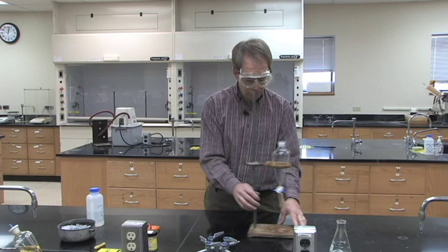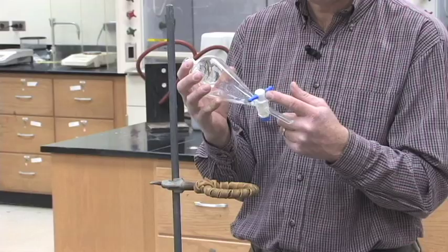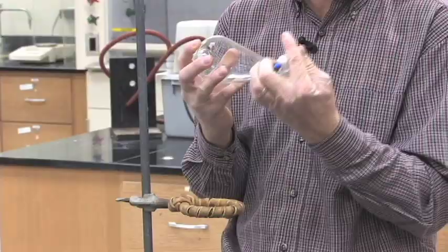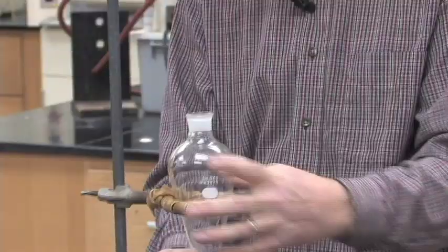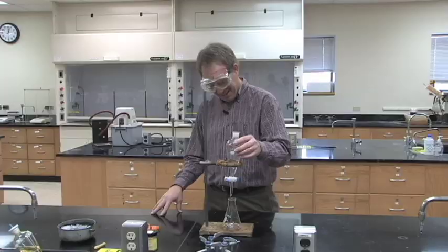To do this lab we will use our separatory funnel from our drawer, and there are two rules when you always use a separatory funnel. The first rule is checking the stopcock and making sure that it is closed — it ruins your day when you pour something in and the stopcock is open and it goes all over the countertop. The second rule is always have something underneath it for when you forget rule number one.